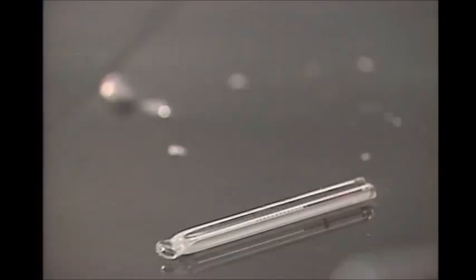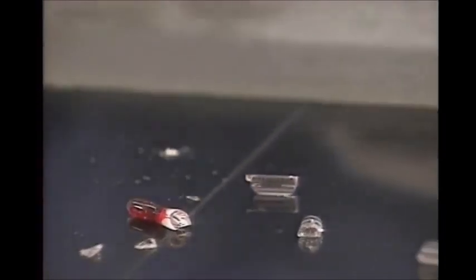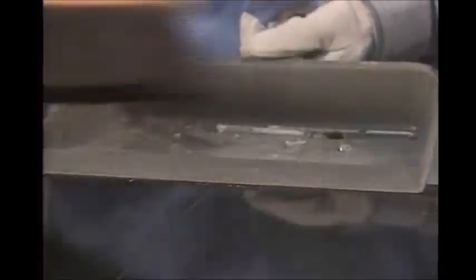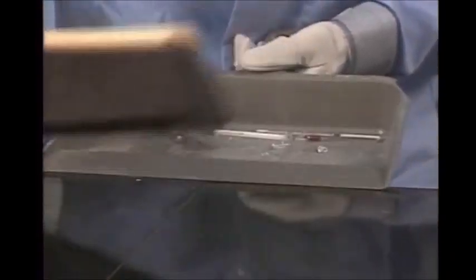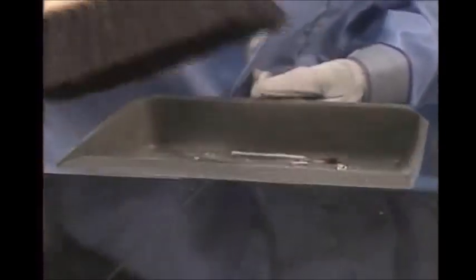When a thermometer breaks, the glass and any liquid that spills out must be cleaned up and disposed of properly. This is a job for your teacher. Glass fragments can be swept up. If any alcohol happens to escape from the glass, it can be wiped up with a paper towel.